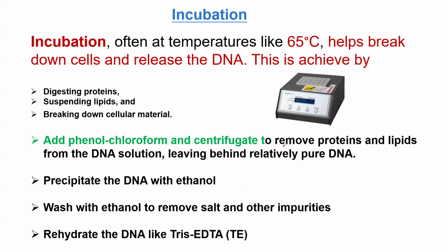Other downstream applications can be PCR or gel electrophoresis. So you already rehydrate your DNA using Tris-EDTA, that is TE buffer. After you do that, the next thing is to store it at -20, that is, in a freezer at -20 degrees centigrade. Then you store it there.